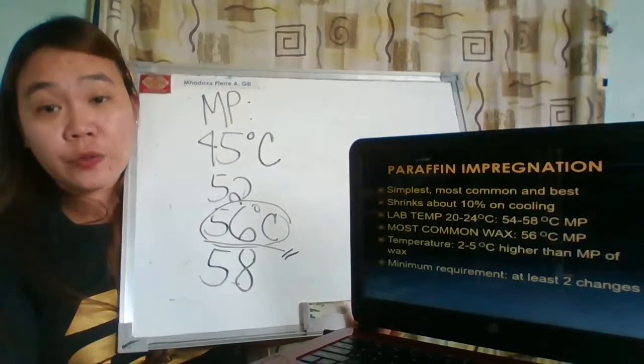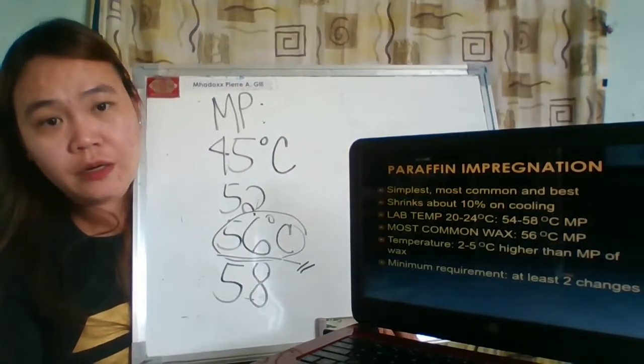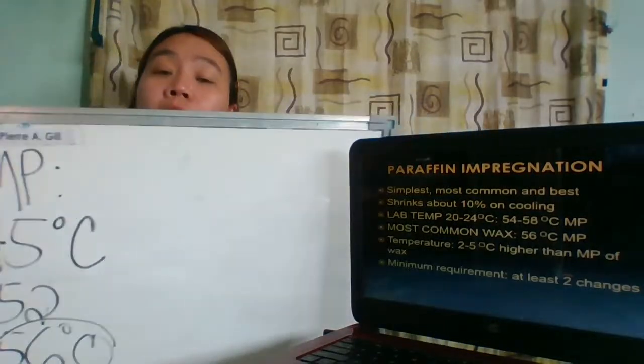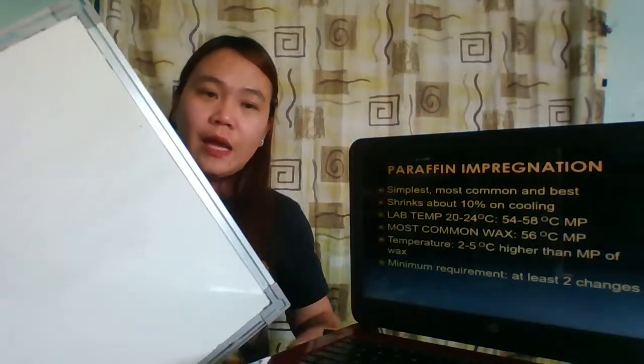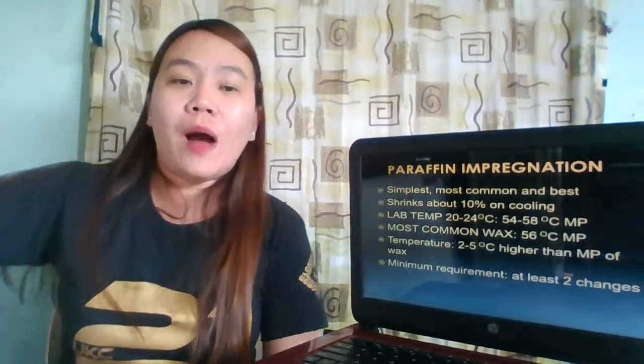56 degrees Celsius. So that's the melting point of our paraffin waxes.